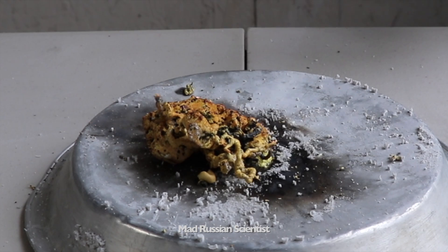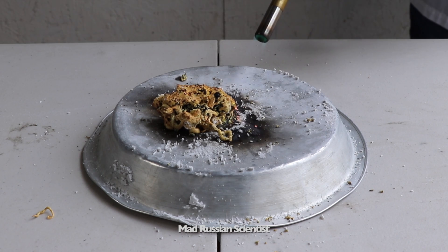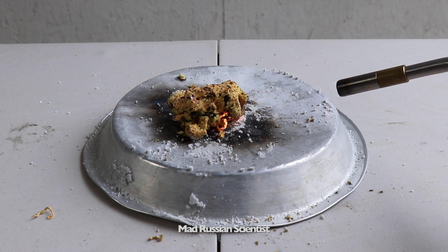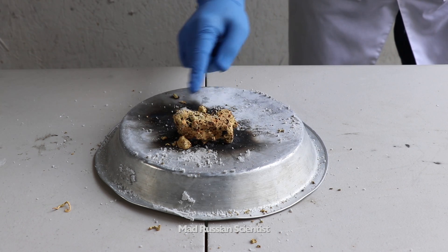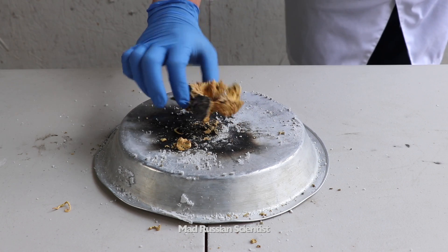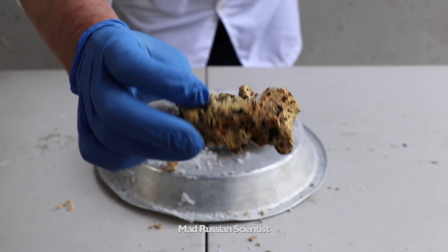It's kind of scary and spooky looking. Oh, look at that one. Check this out. It's hot. Very light though, almost no weight. That's crazy. Look at this.